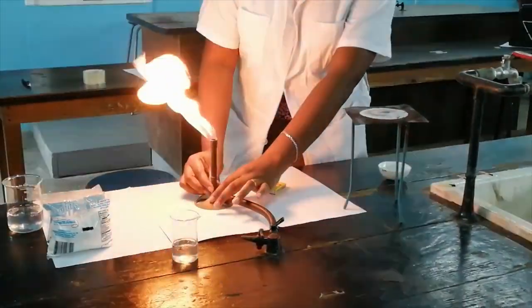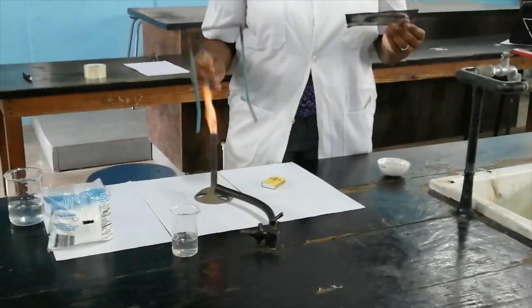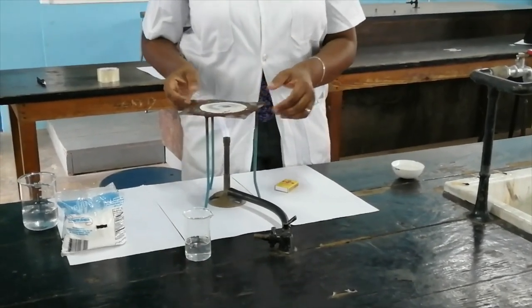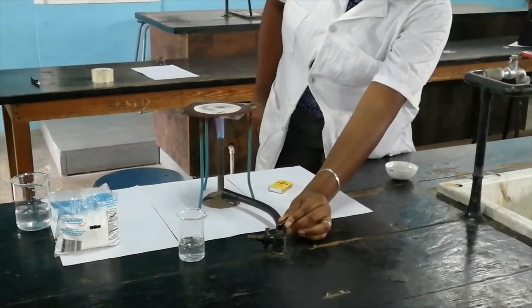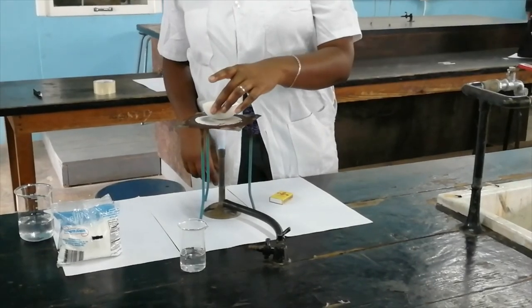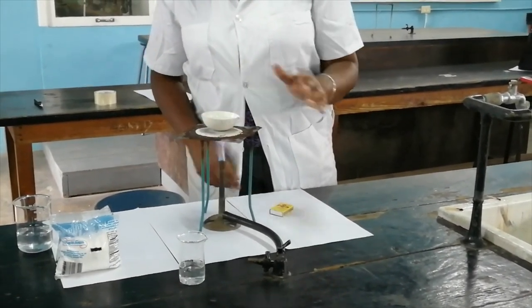After we've lit the Bunsen burner we open the air hole, and we're going to put the tripod over the Bunsen burner. We're going to turn up the flame just a small bit more and then put our evaporating basin on the wire gauze.